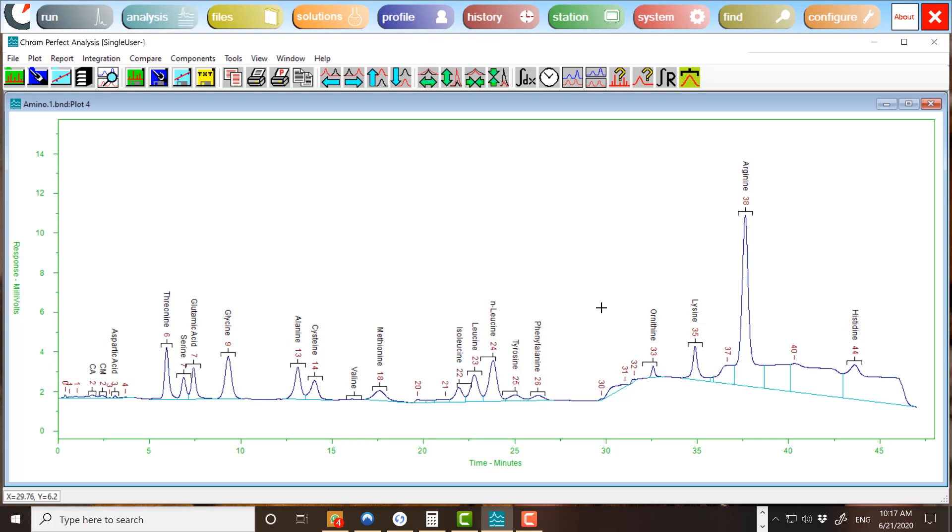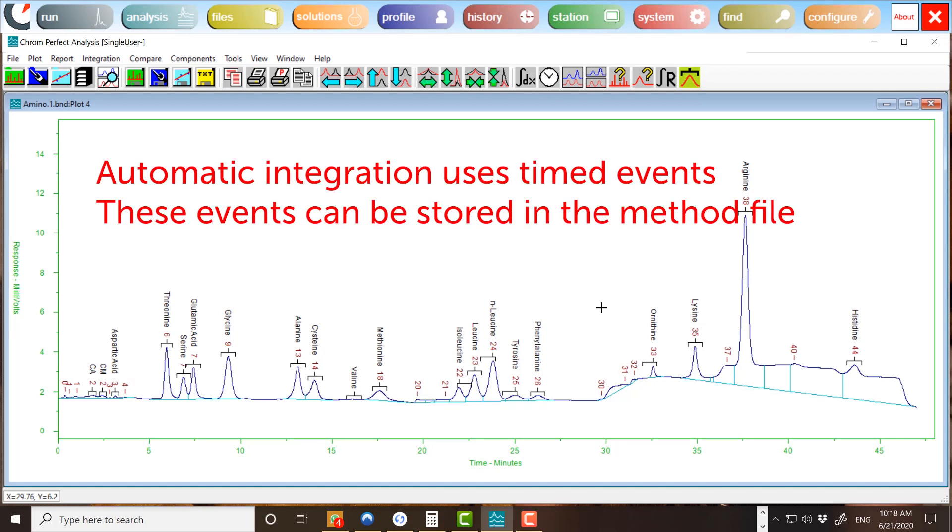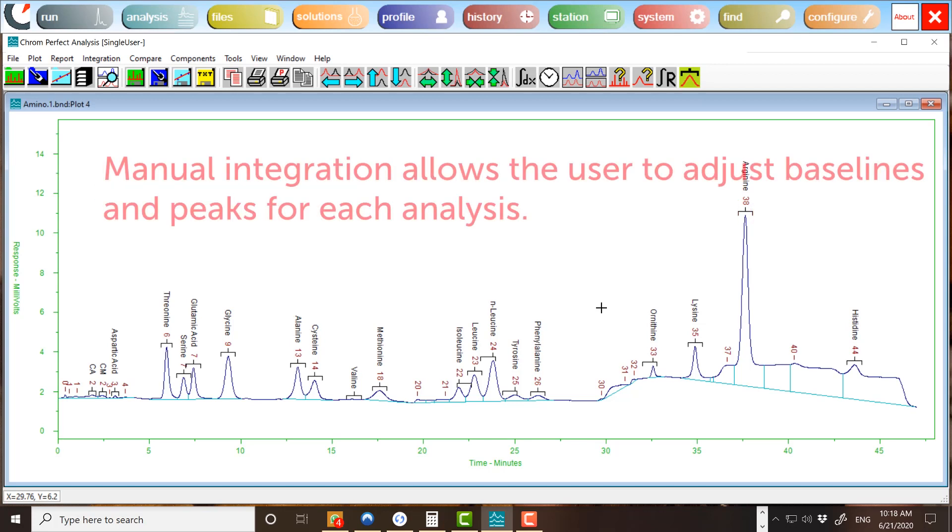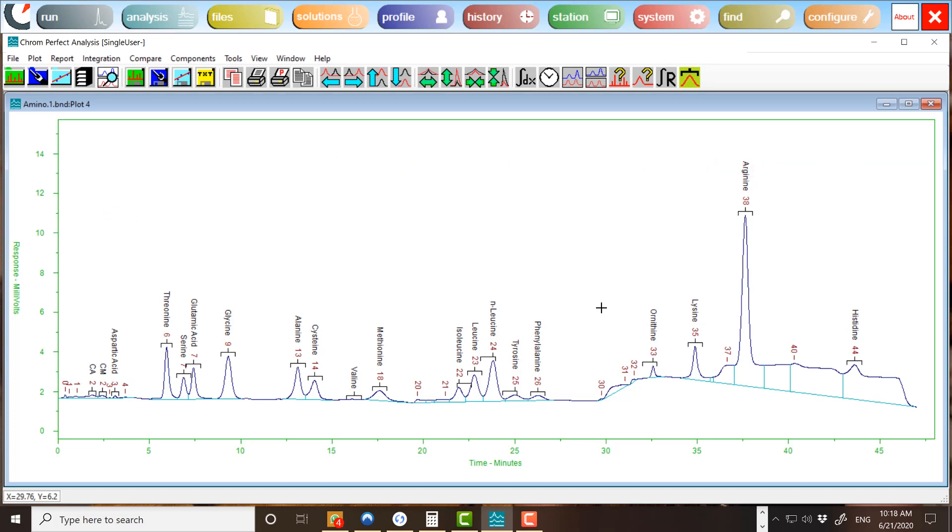If the peak detection or baseline integration requires more attention, there are two options available. Automatic integration uses timed events at certain points in the chromatogram. These events can be stored in the method file, so no user interaction is required for future analysis. Manual integration allows the user to adjust baselines and peaks for each analysis. This can be time-consuming. Therefore, manual integration should be used as a last resort when automatic settings cannot produce reliable, reproducible results.